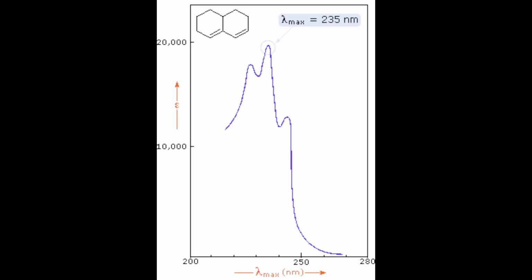Next, we must relate all this to how it helps us find our lambda max. A lambda max is the point or wavelength in which a solution reaches its highest level of absorption of light. By scanning across all wavelengths, we are also identifying our lambda max, which can be used for finding the concentration of solutions and qualitative identification of different substances.